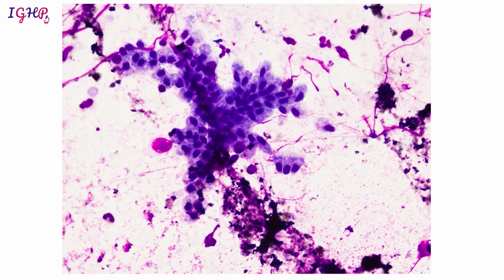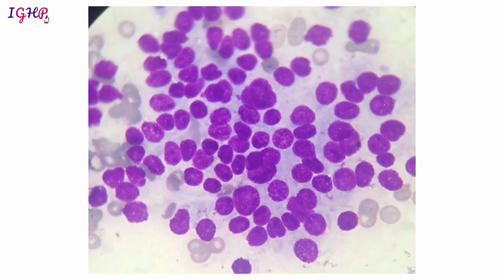Now suppose from the same lesion we get a cell cluster like this, in which there is some columnar epithelium, there is little atypia, and suppose in this background we are also getting many polymorphs, many inflammatory cells. Since the lesion is not looking atypical enough to be called equivalent to a malignancy, and it is not looking like a normal luminal contaminant either, this is what we are going to call atypia, in which you are not able to categorize it further, and at times this atypia could occur secondary to a regenerative or reparative phenomenon also. So this is your category 3, in which you are going to call it atypical.